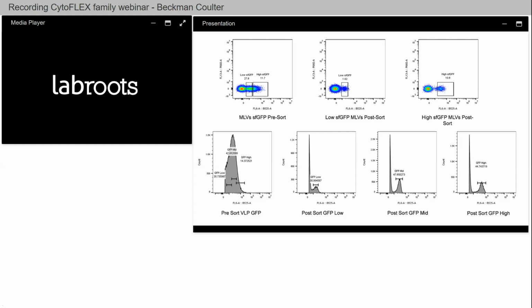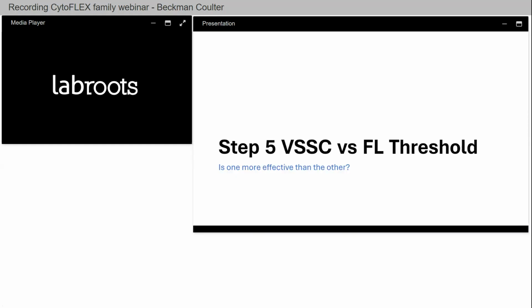used to when we're looking at our normal cell sorting, right? We're always looking for that 90% or better of our sorted population. We're trying to do purity or single and get really, really high purity results. And that's not exactly what we're seeing here. So, another thing I'm asking you to put into the back of your brain for a moment, that we're going to touch more base on.